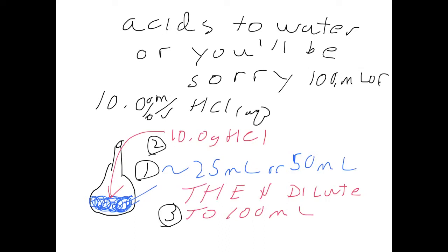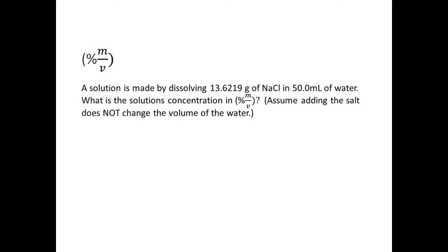But when there's no safety issue, such as making salt water, you measure your solute and dilute to solution volume. You're still diluting to solution volume with your water here. However, you have to have a little bit of water in there to start off with for safety. Always think safety.